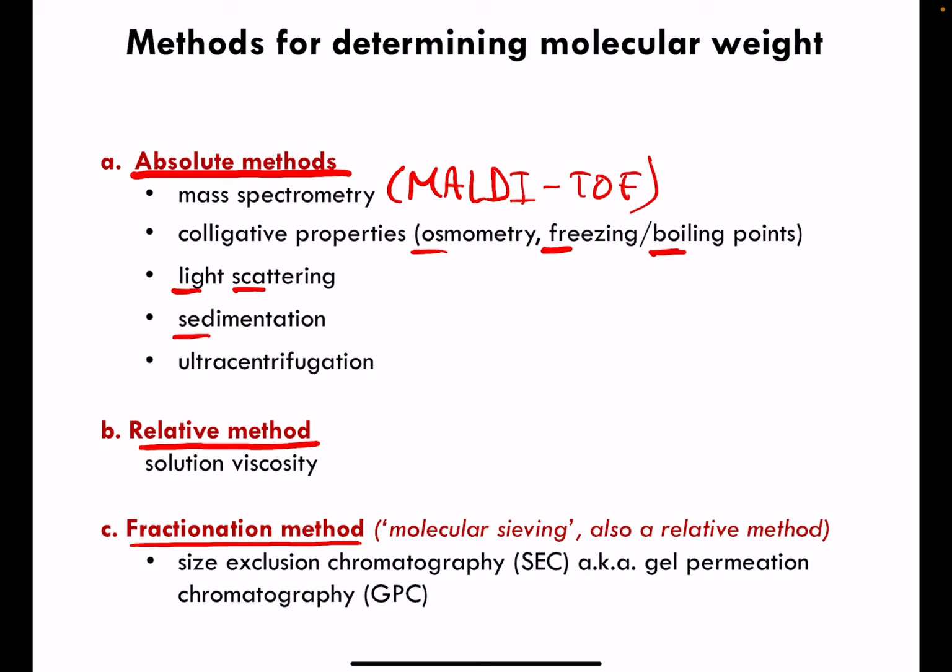Sedimentation, the rate at which a molecule is allowed to be gravitationally attracted to the bottom of a container. And ultracentrifugation also exploits that characteristic and can determine the molecular weight in an absolute sense.